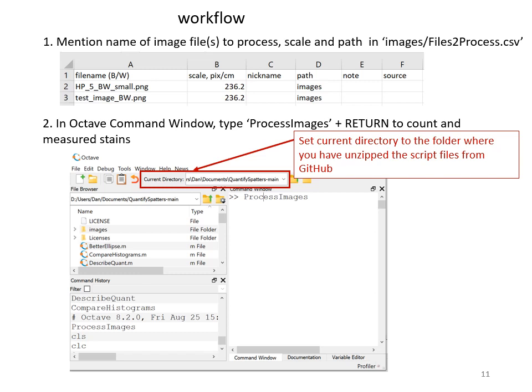And the software works with queues. That means you can indicate tens of images to be processed while you do other things. The second step is to open the Octave software, where you have a command window, and you can enter the name of the scripts that you want to run. The first script to run is process images. It's the script that will count and measure the stains. So you just type that in the command window, and you hit return, and the processing occurs.